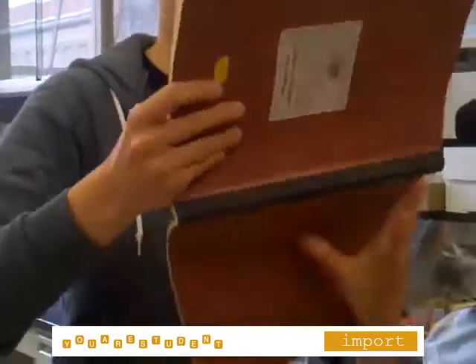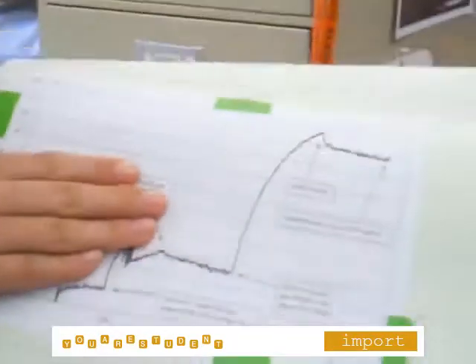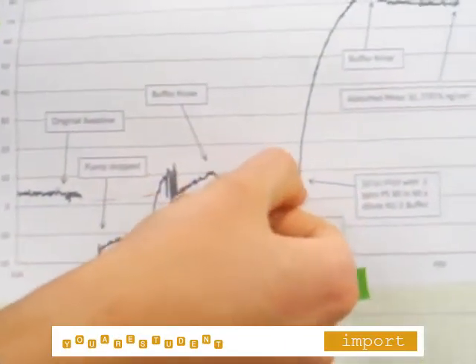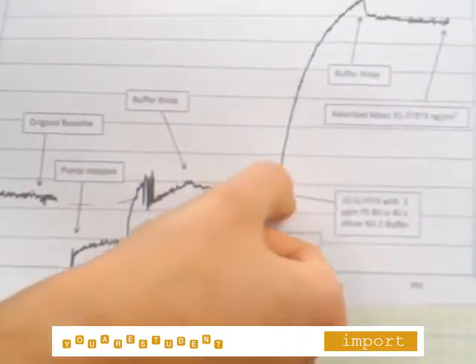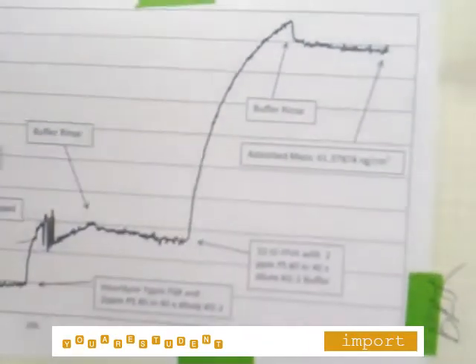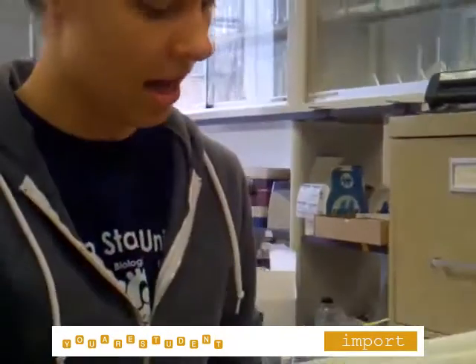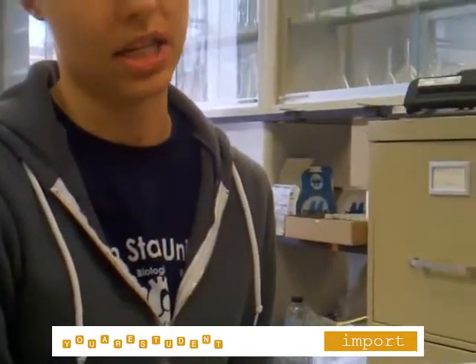But here's an example of the kind of data I get from the instrument. There's nothing sticking to the surface, and then when I put protein in, a bunch of it stuck, and none of it really rinsed off. So what we'd like to see is that if we use a different type of surfactant, there would be less protein sticking to the surface, and it would be really easy to recover the protein.